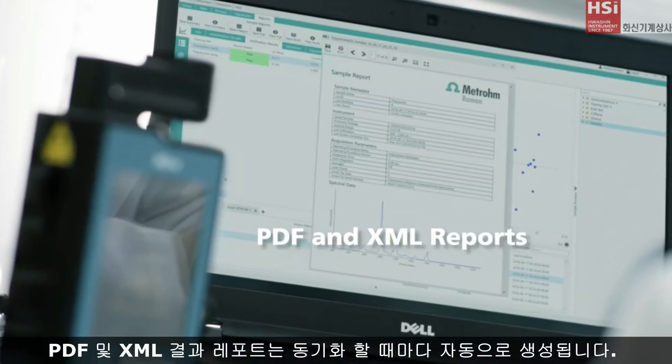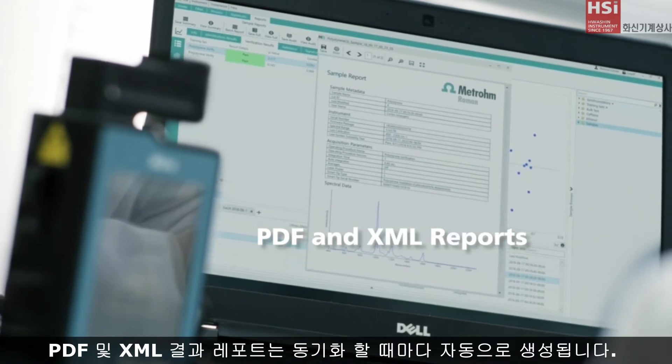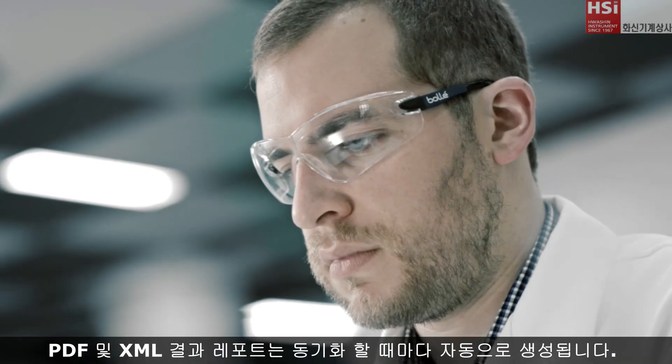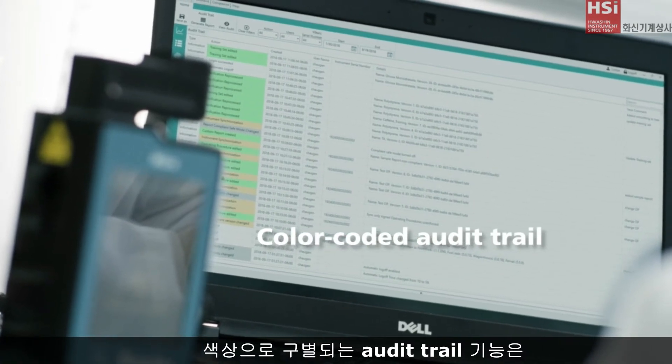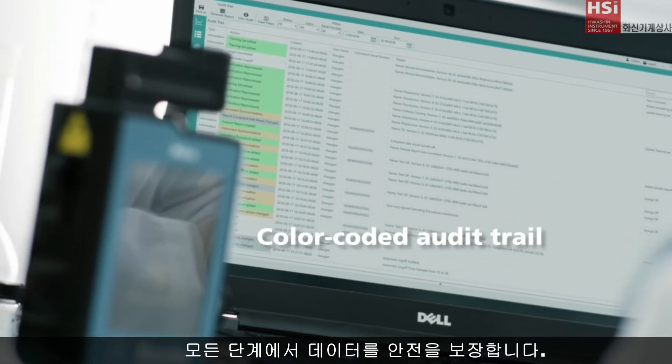PDF and XML reports are automatically generated on every synchronization. The color-coded audit trail gives you peace of mind every step along the way.